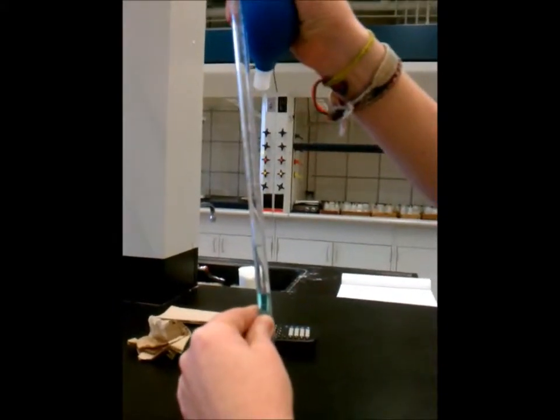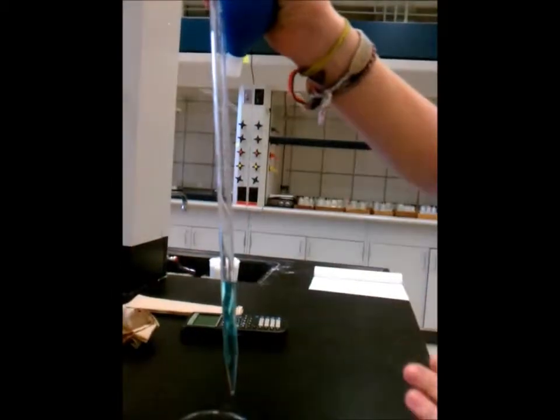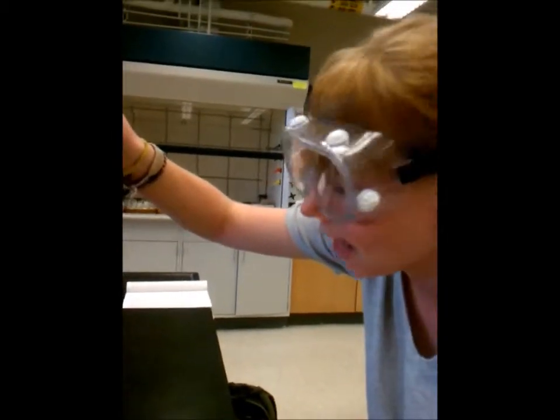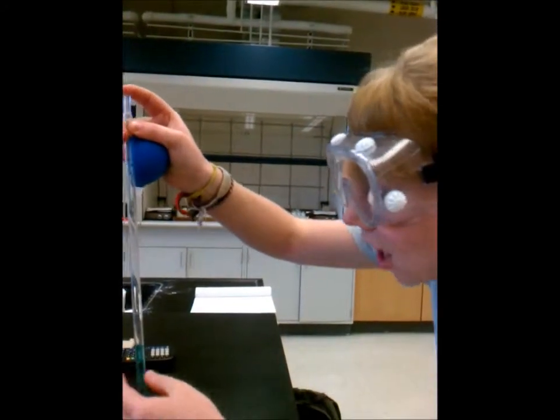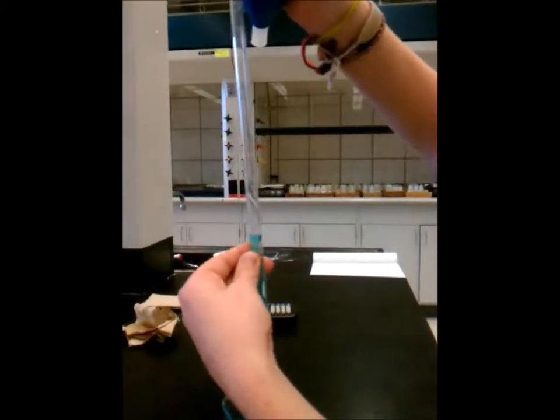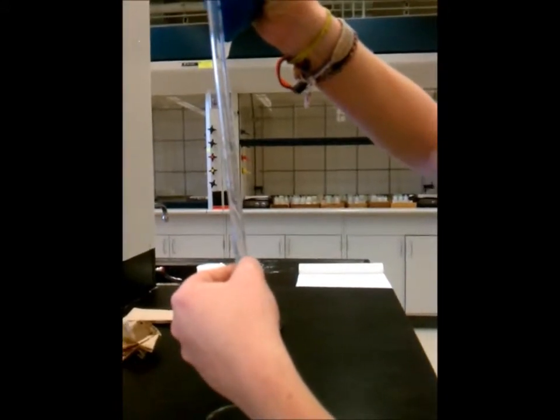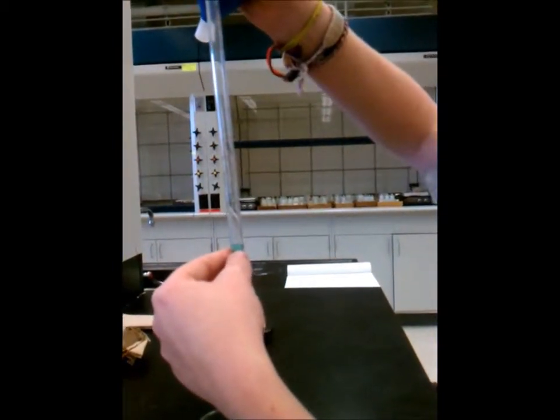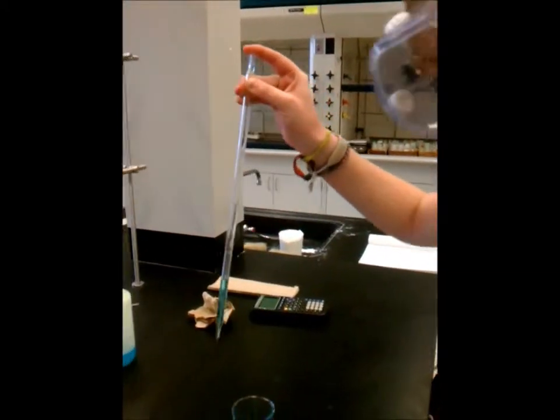And you do this by looking at the bottom of the meniscus, which is a concave surface. That happens when the water molecules are attracted to the side of the glass, and so they rise to the side, and it allows there to be a concave surface. So you want to make sure you read the bottom of that. And my initial volume is 8.10. And then you're going to write that down in your notebook.